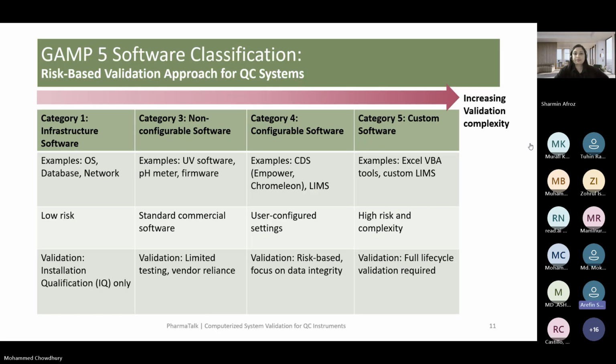Actually, I have a couple of questions. I'm repeating this again. A laboratory software system like LIMS is installed, and I have seen that it has never been audited or revalidated again. The auditors, I don't know why, in most cases just don't look into it. Most of the time we just update or repatch it and there is no validation again.